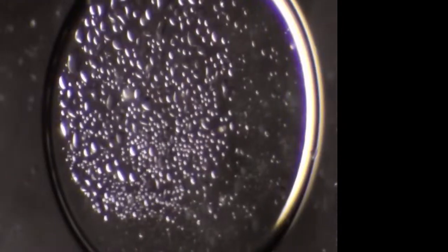Kinds of debris here. So far, nothing else too interesting, just those few swimming guys. Nice bubble again. We're lucky to get something to go for a ride like that one thing did the other day. Let's see. It's a nice crystal of something in the water.